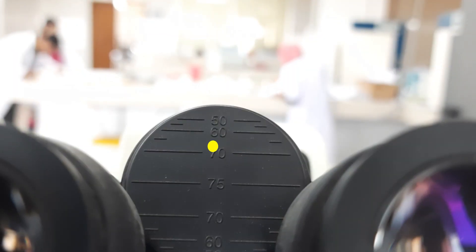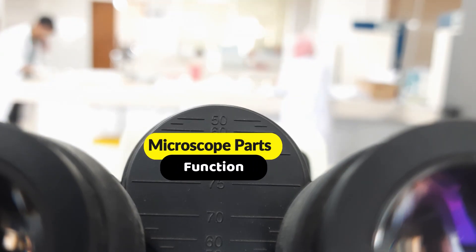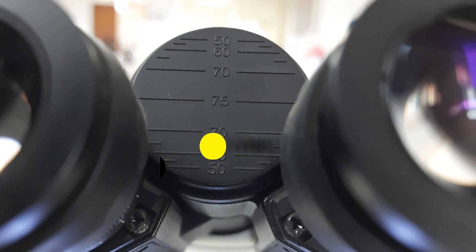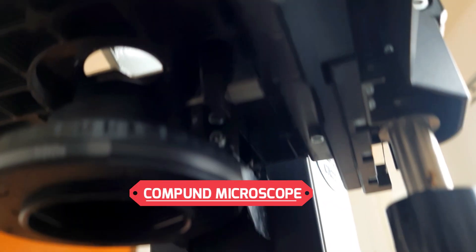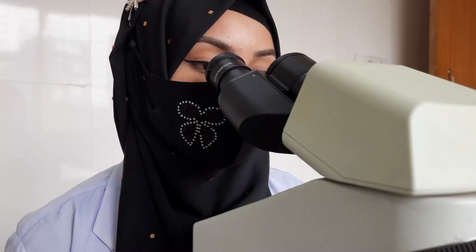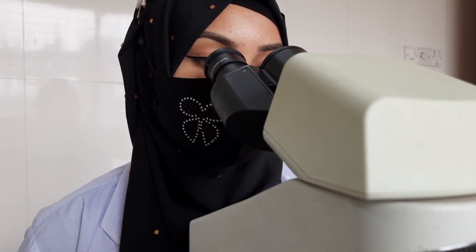Today's video will be on the parts of a microscope and their functions. In this video, we will take a closer look at the main components of a typical compound microscope and explain their roles.